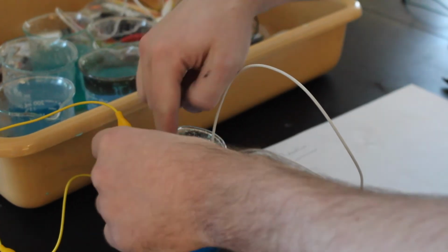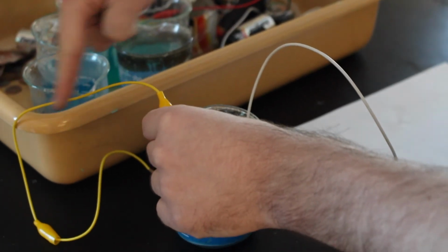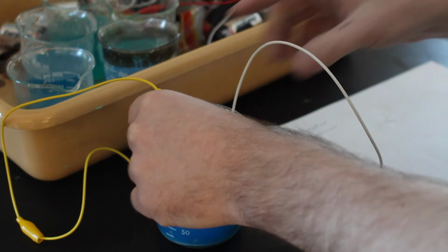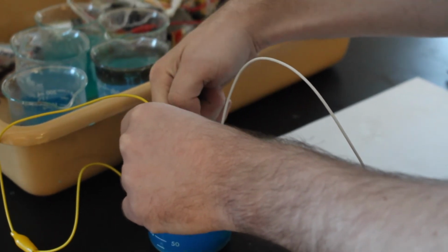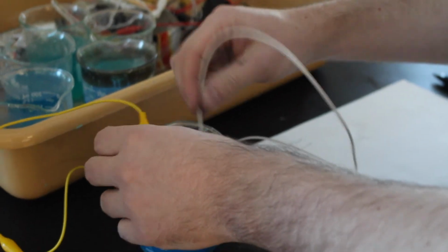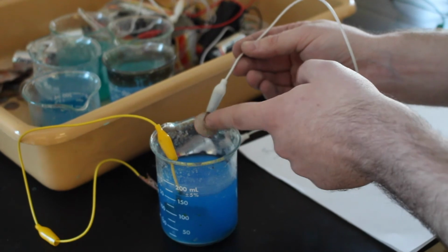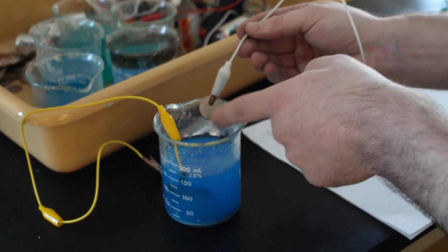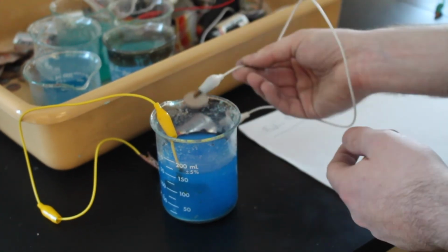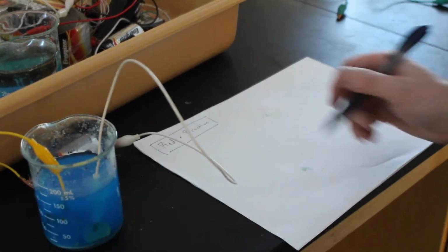The battery is pulling electrons away from the copper, causing copper 2 plus ions to form in the liquid. Then, because the surface has a negative charge, those copper 2 plus ions get reduced and deposit onto the surface. If I were to let this sit in here, it would have a copper coating to it. So that's your redox reaction, losing electrons and gaining electrons.